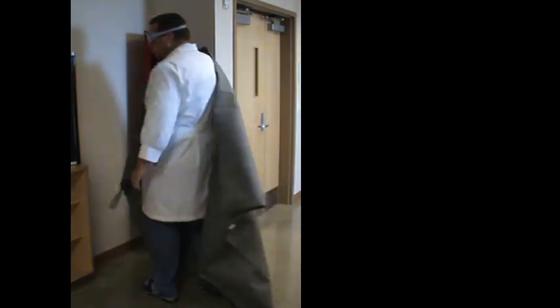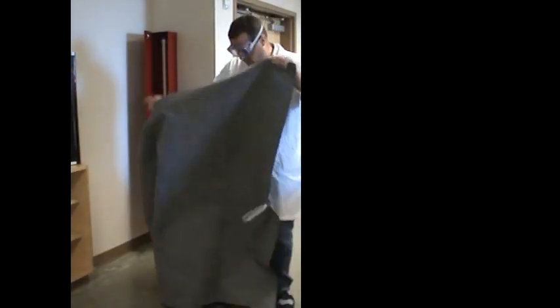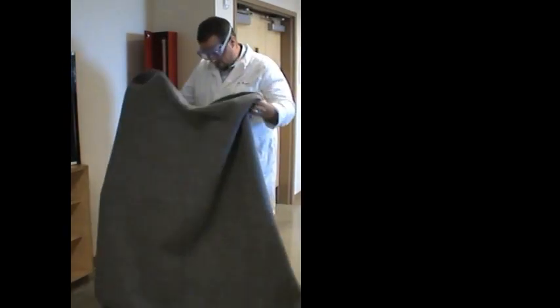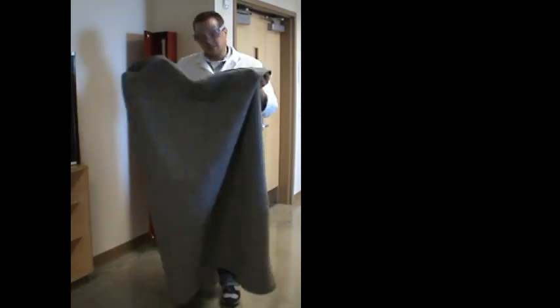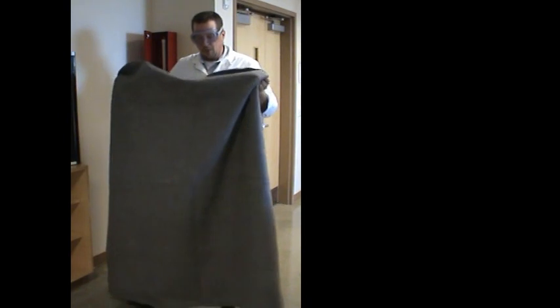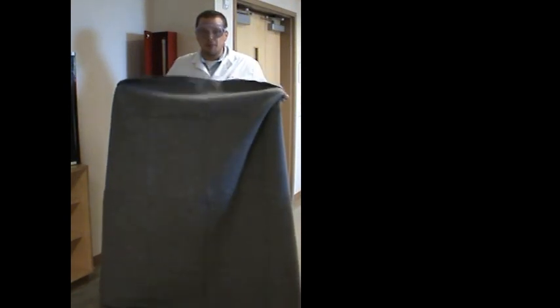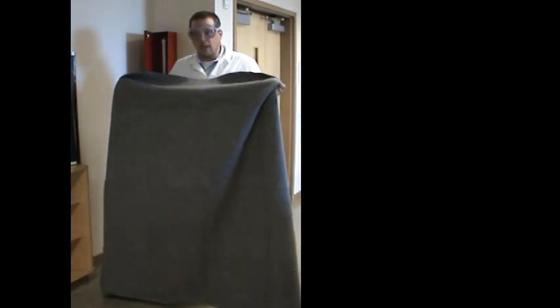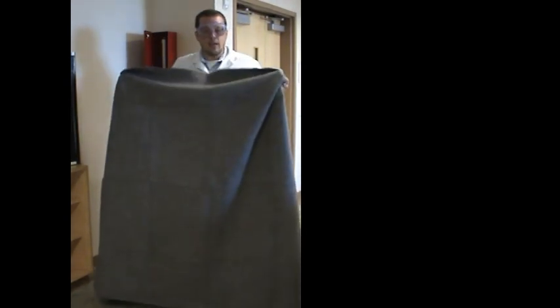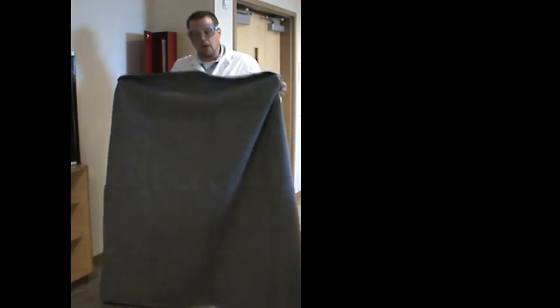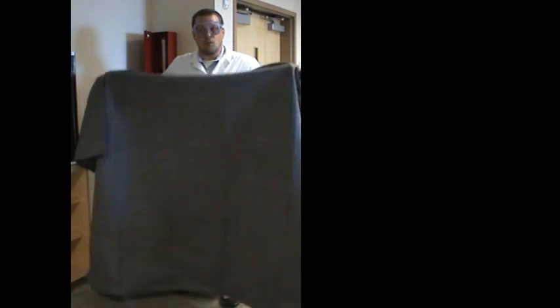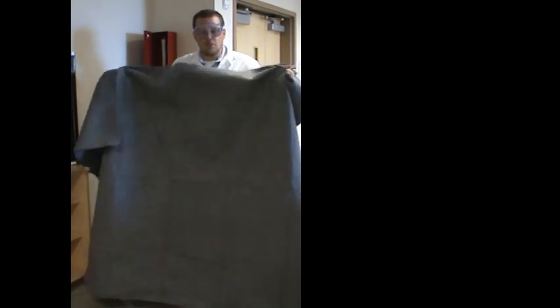And if I needed to, I could hook an arm in it and wrap it around myself a little bit. Now, putting out fires really isn't the best thing that these are used for, but there are a couple of other things that the fire blankets are really good at. If somebody's using the safety shower, they're probably going to be, at the very least, cold and maybe a little in shock, embarrassed, other things. So having a fire blanket around to wrap them up after they're finished using the safety shower is a good thing.